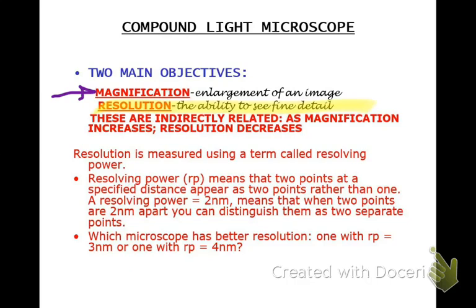Okay, the resolving power, that's how good your microscope is. That is how close can two items be and you still be able to see that it's two items. So if here's a dot, like a bacteria, let's try this. Okay, so there's a bacteria and there's a bacteria. And they're so close together, but you can tell that they're two dots by looking at it.